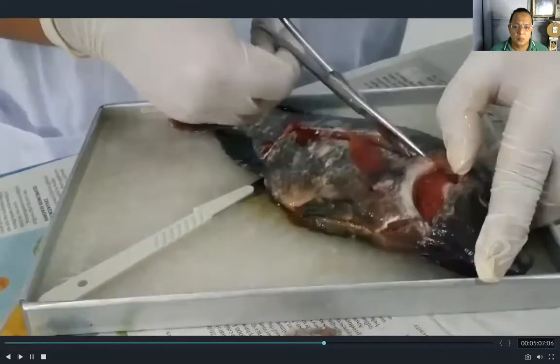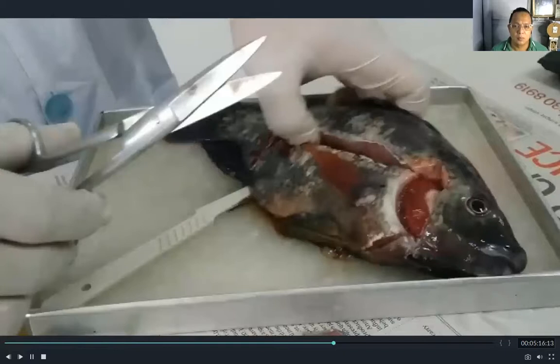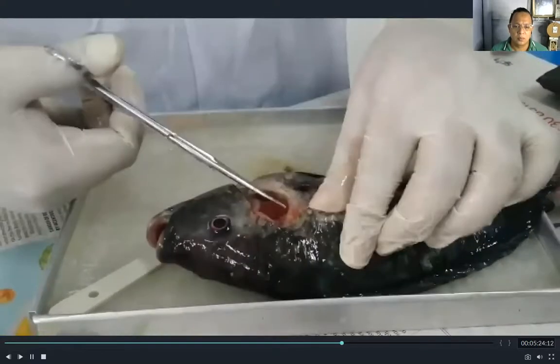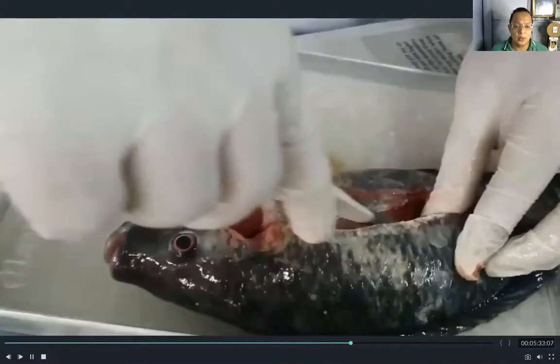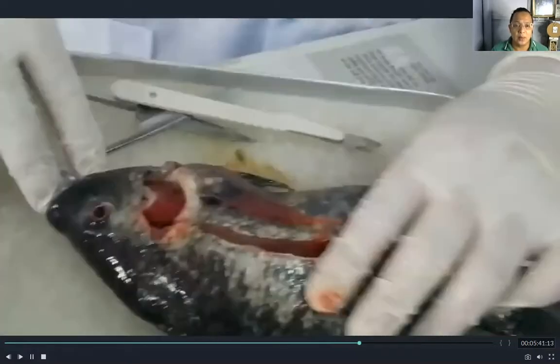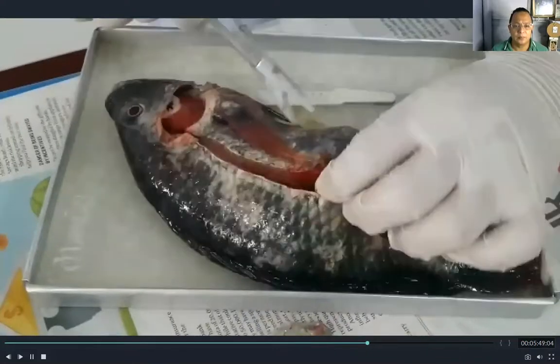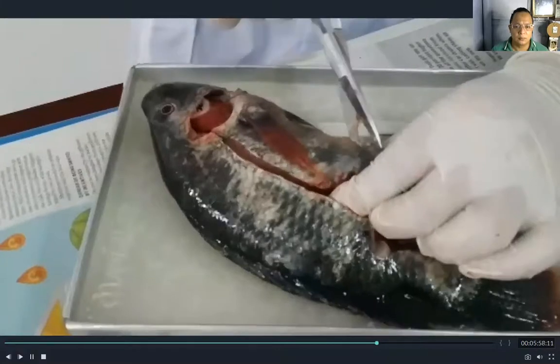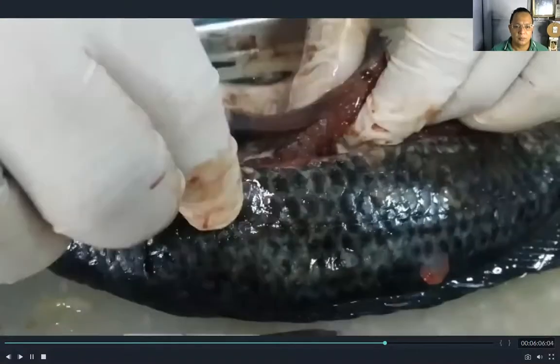You need to cut carefully and be very careful when using sharp instruments, especially scissors or a knife. Make sure not to cut the internal parts. You have to be very careful in removing this section.